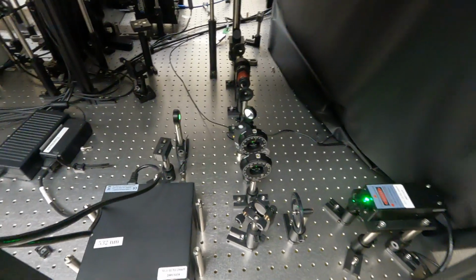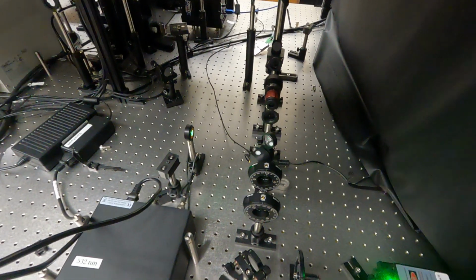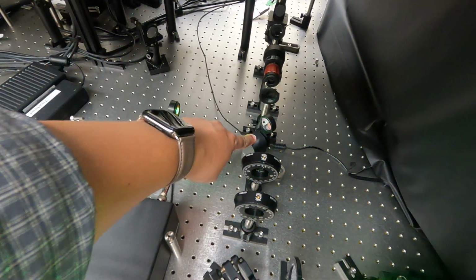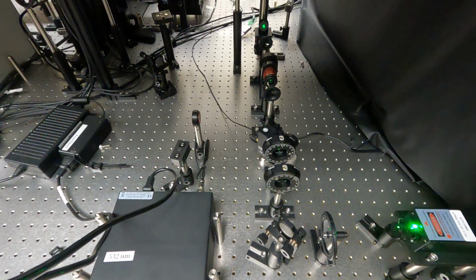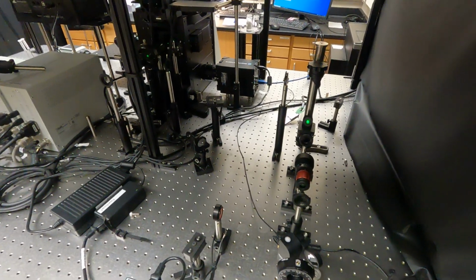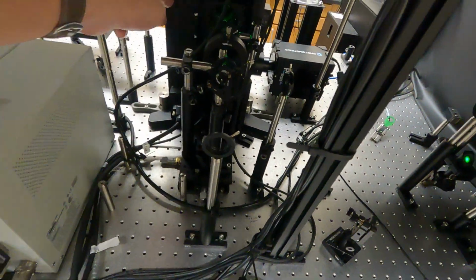Once the laser power is set, we press this button another time. The flip mirror will be in the down position, and now the laser light can go all the way and get into the microscope body.